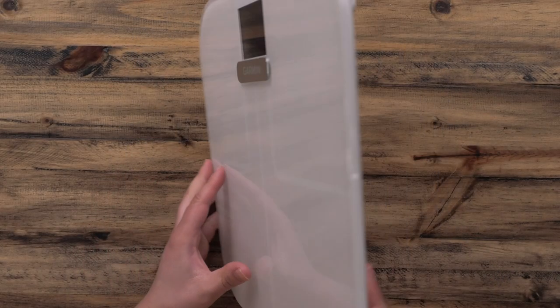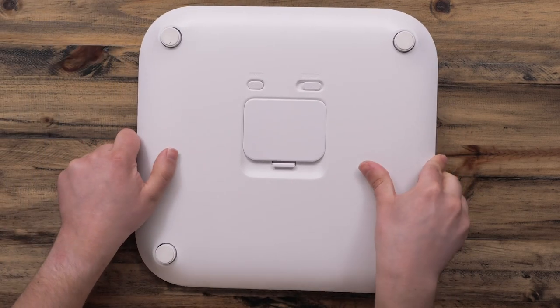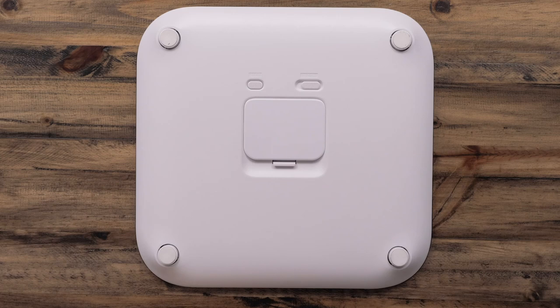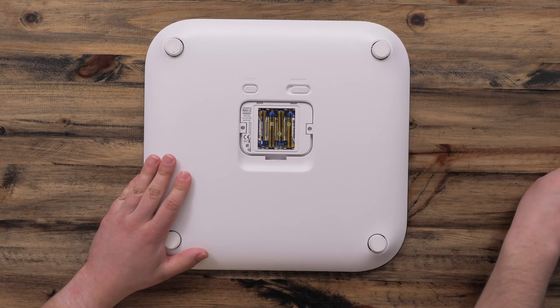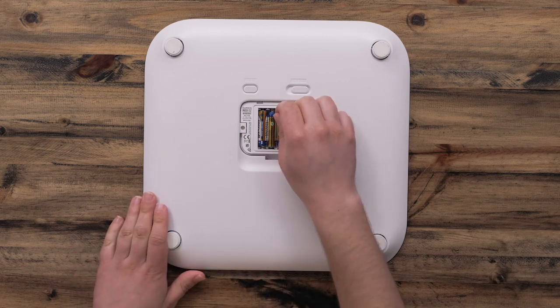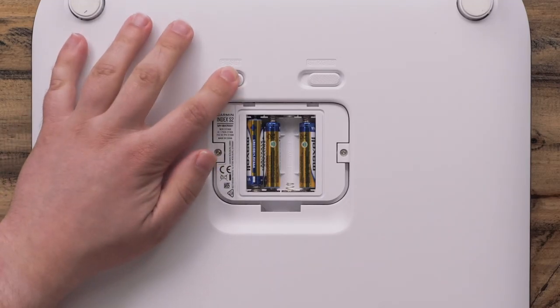Begin by turning your scale over and locating the battery door and reset button. Then, remove the battery door. Remove one battery.